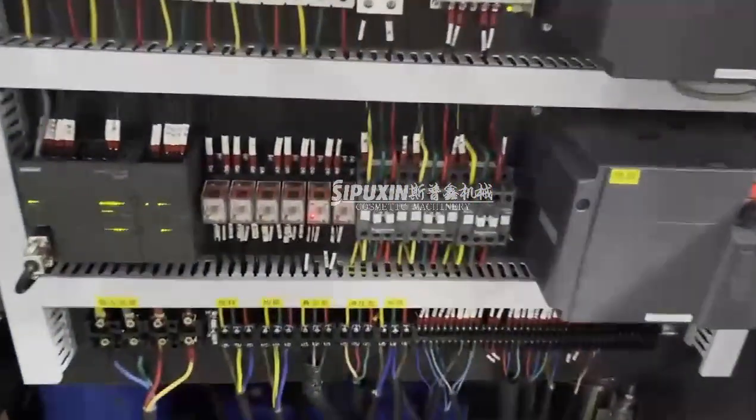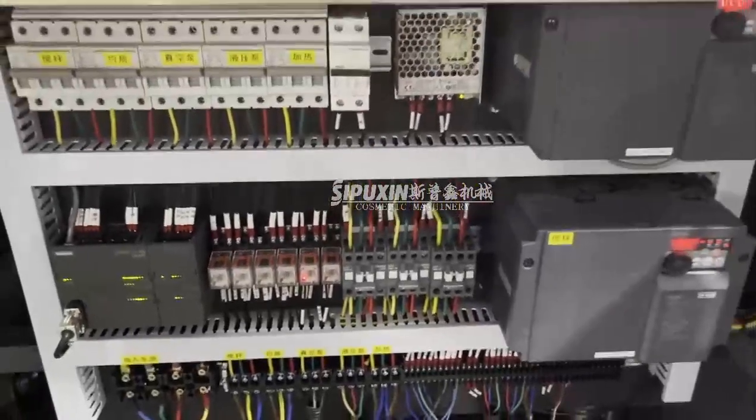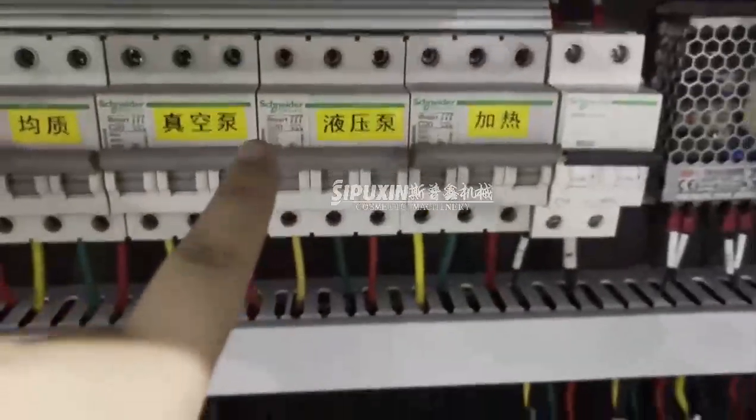Electric components. All the main parts are using Schneider brand components.